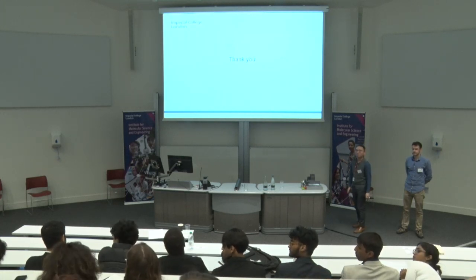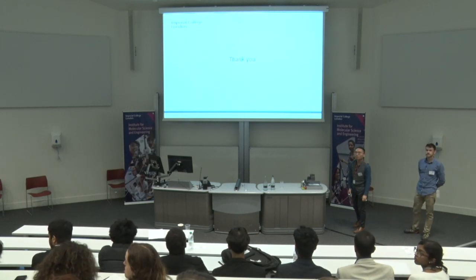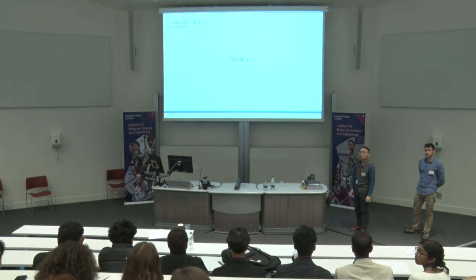Thank you. I wondered if you could say anything about how quickly you think those metal crusts, the white surface blooms, might reoccur, because you've obviously got metal soap still in the ground layer. Do you think the ion hopping process will continue to happen and that those disfiguring crusts will reform?